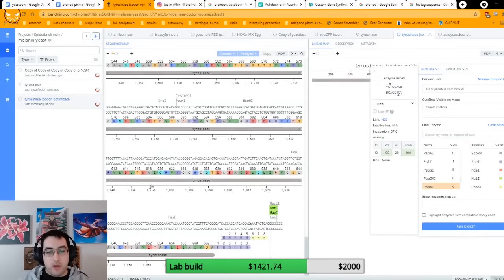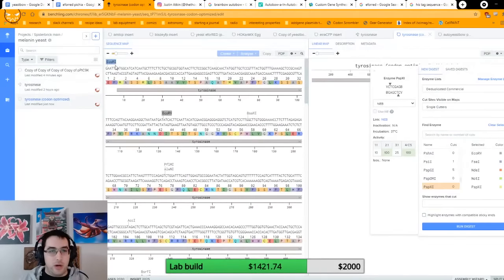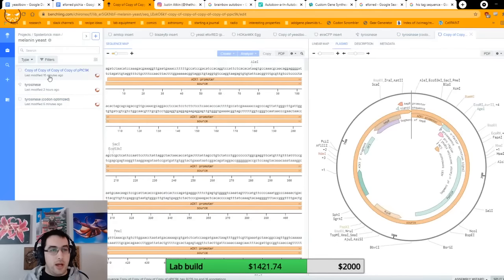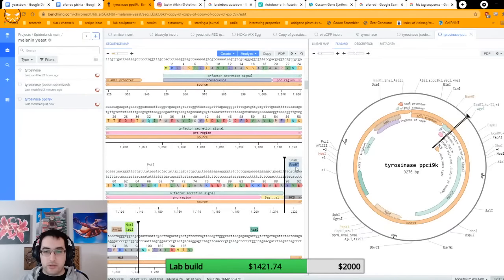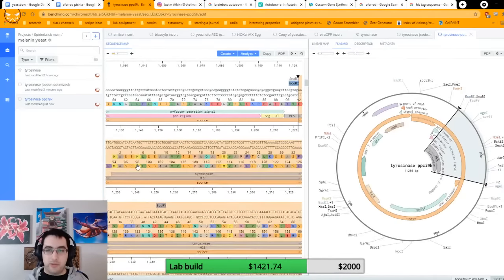Cool. Now we've got all of the features that I want in this thing. So now I can select Not I, scroll up and select EcoRI, and copy. Now this is my backbone. I'm going to rename it before I do anything, which is going to be Tyrosinase pPIC9K. Always label everything. Cool. Now we go to the multiple cloning site. We select EcoRI, Not I, paste.